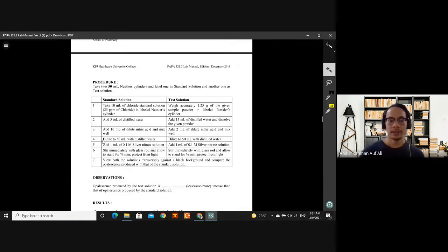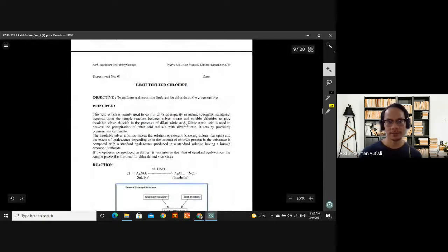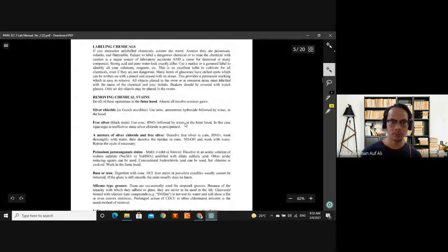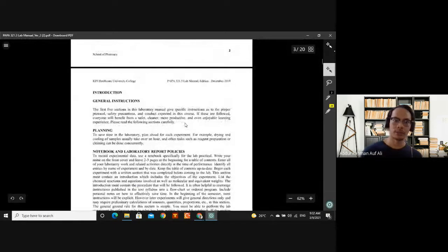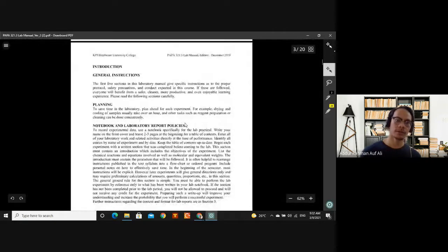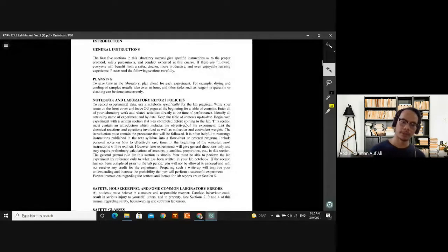Okay, and then before we go into the details of the first test, saya nak brief lah sedikit sebanyak about the practical class because this is what we are supposed to do kalau kita masuk makmal. So sedangkan kamu, disebabkan kamu tak boleh, kita mesti it's good to know juga lah, okay, what is the etiquette bila masuk makmal, apa yang kita kena pakai. So the most important part, the most important thing when you go into the lab is your gowning. Okay, what is your pemakaian.